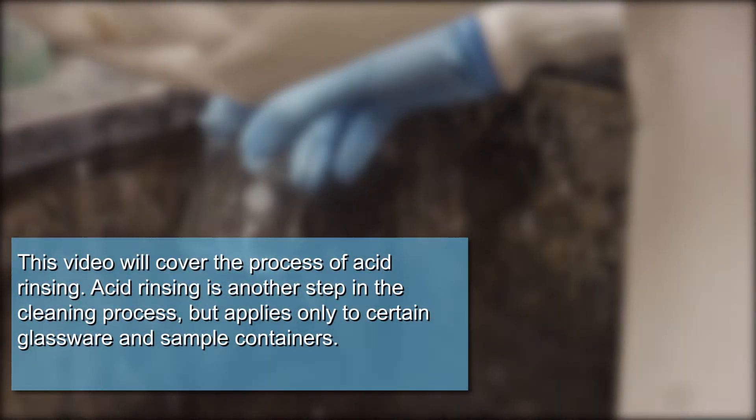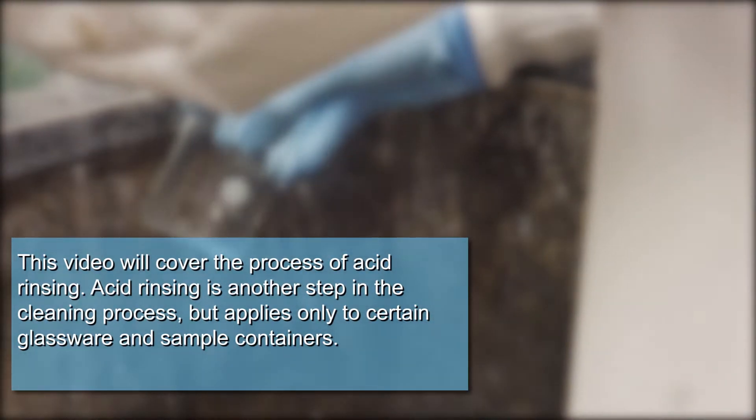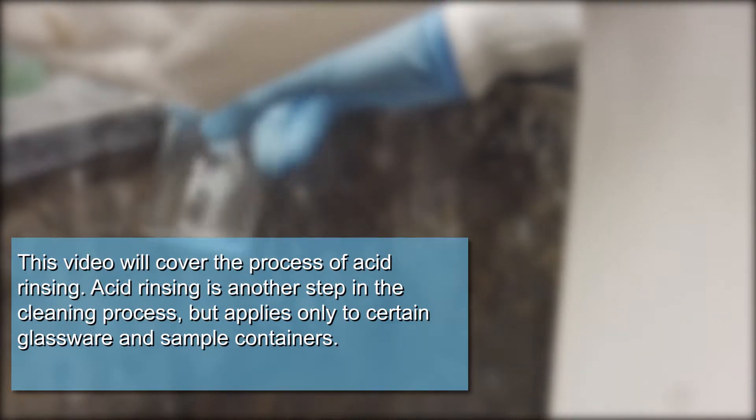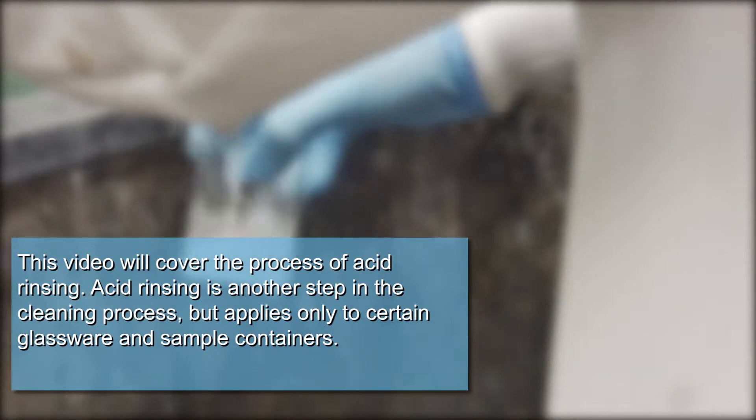This video will cover the process of acid rinsing. Acid rinsing is another step in the cleaning process, but it applies only to certain glassware and sample containers.